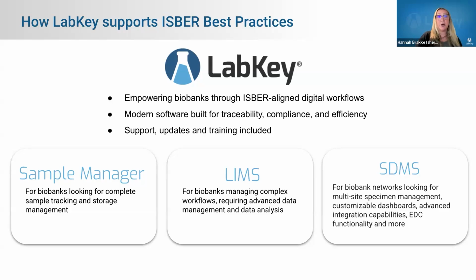So Sample Manager, as a standalone product, is really ideal for biobanks that need robust day-to-day sample tracking and storage management. Because it's intuitive and quick to implement, it's really good for teams who are ready to move beyond spreadsheets or Access or homegrown systems, moving into that built-to-purpose software that we just talked about.